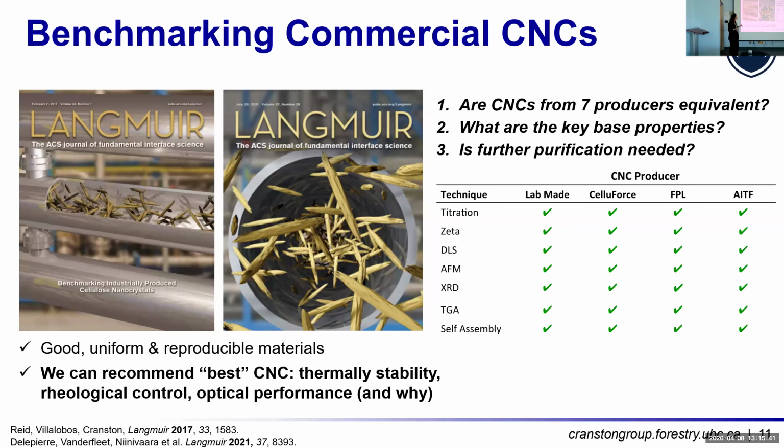Now, where they did differ allowed us to start to make recommendations. And so we're not saying one cellulose nanocrystal is good and the other is bad, but we're saying if you want the best thermal stability, we know which one. If you want the best optical properties, or if you want the one that's a good rheological modifier, choose this one, choose that one. You see the point.